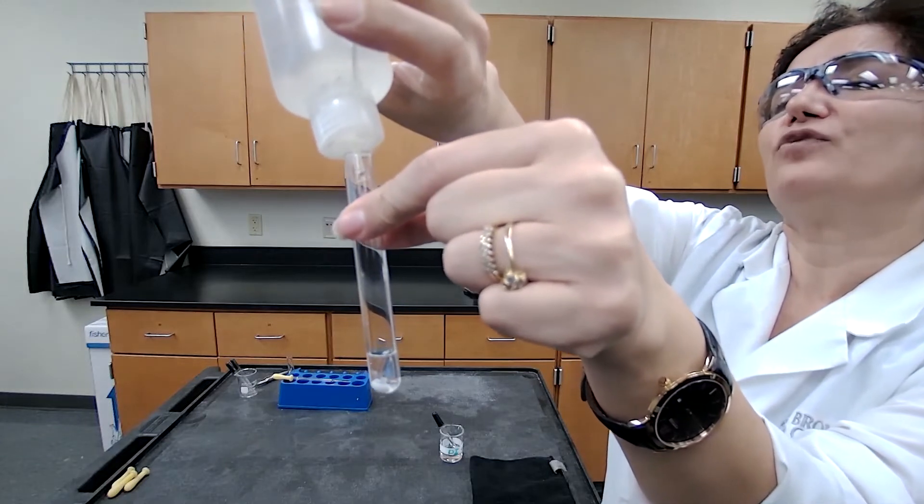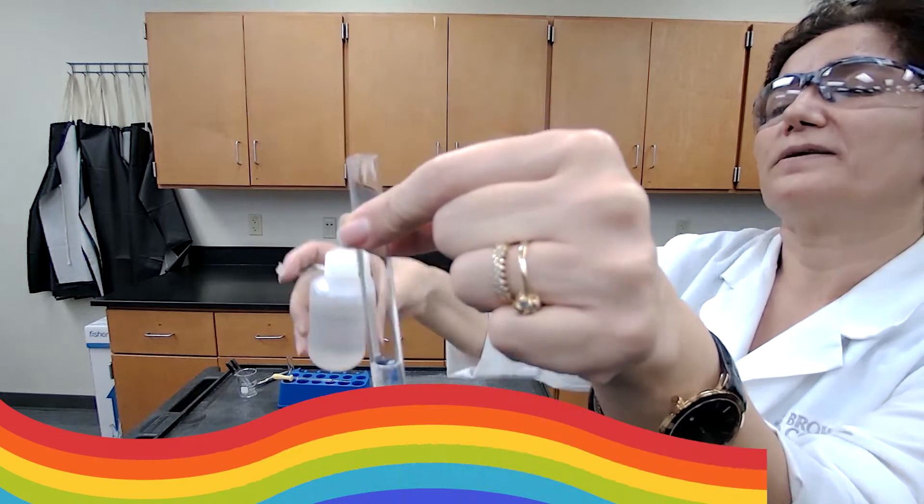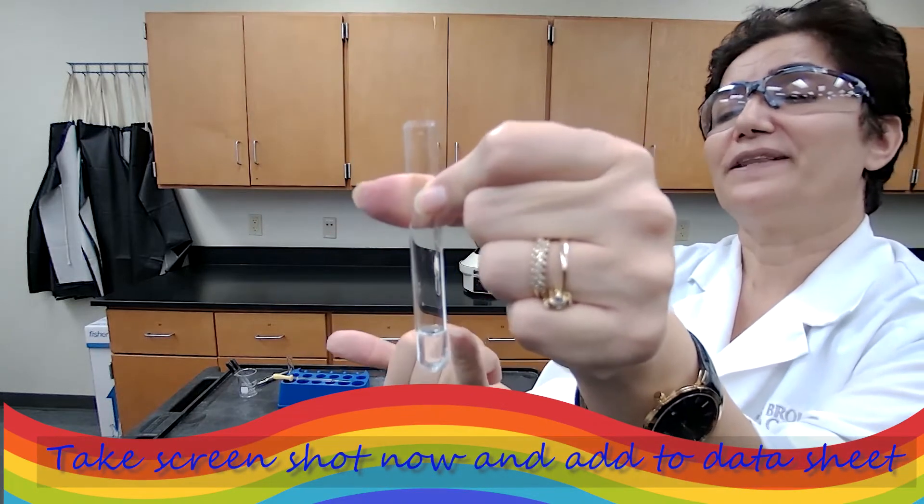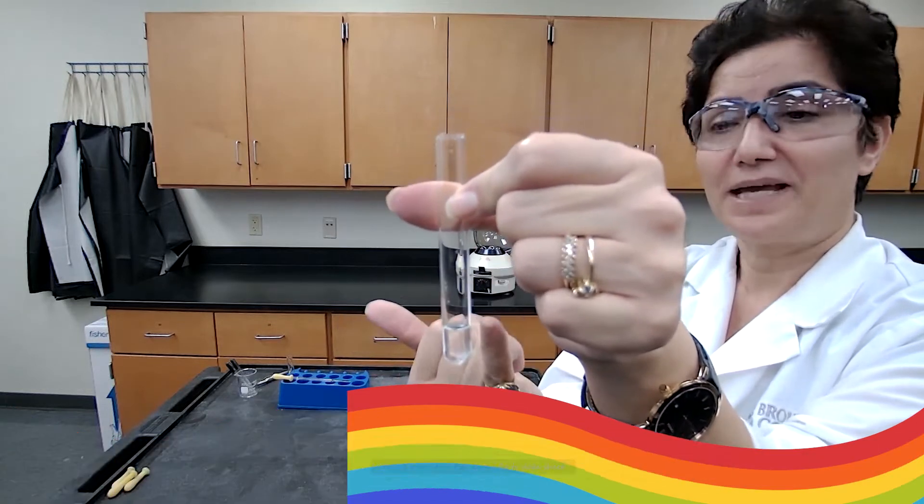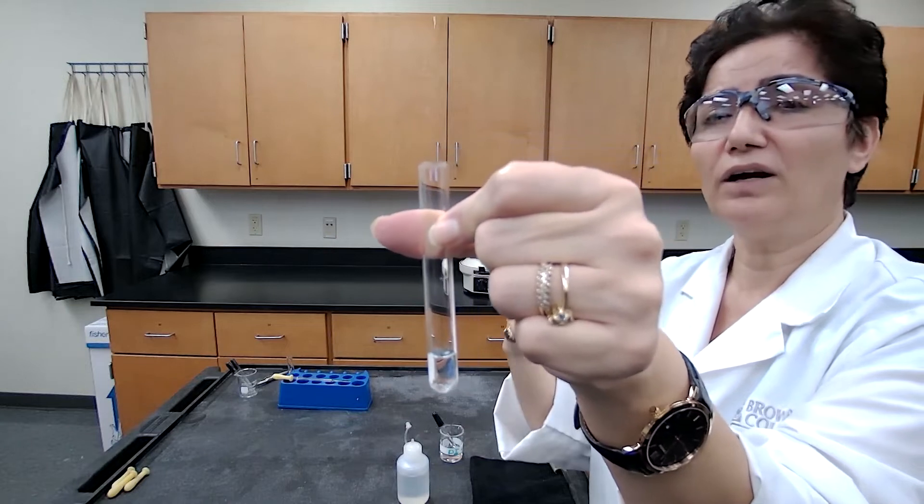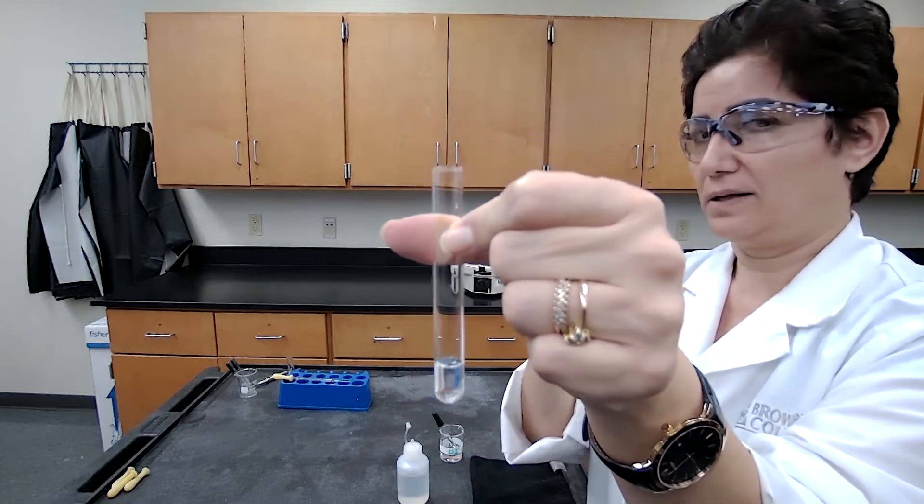If new precipitate forms, the clear solution would turn cloudy again. If it does not turn cloudy, that means the precipitation is complete and the amount of HCl I added earlier was enough.